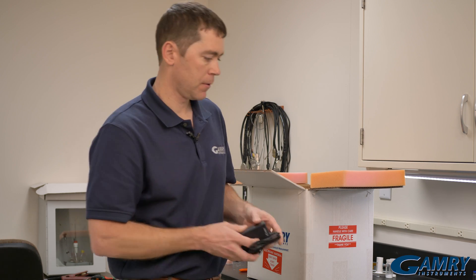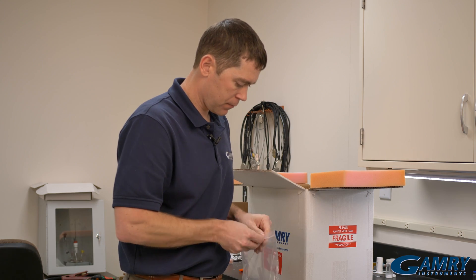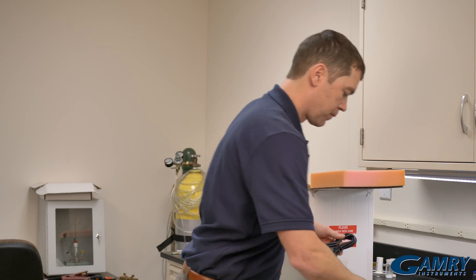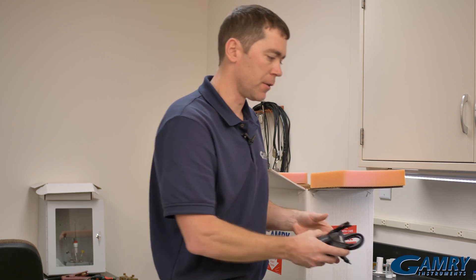Next we come across the potentiostat power supply and the power cable, which you connect to your power supply and then to your power outlet.